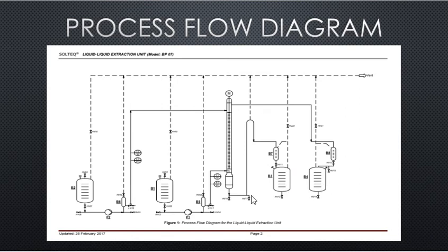The last part is the rotating disc stirrer. In this rotating disc column, there is a rotating disc stirrer.